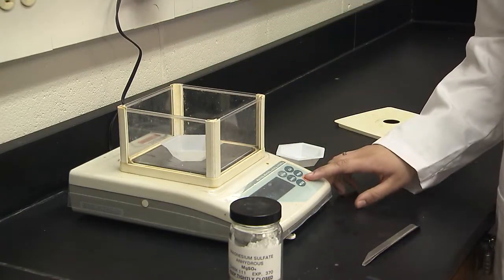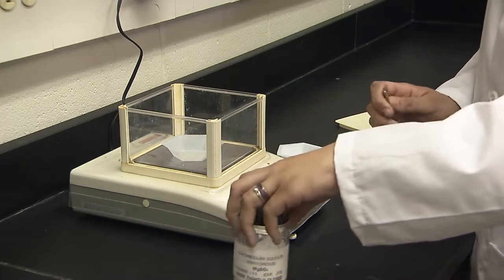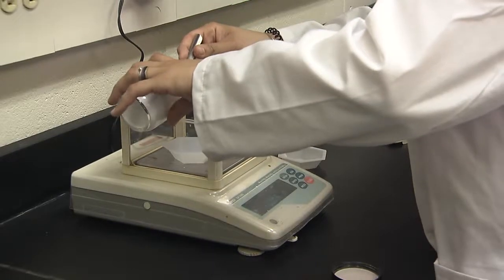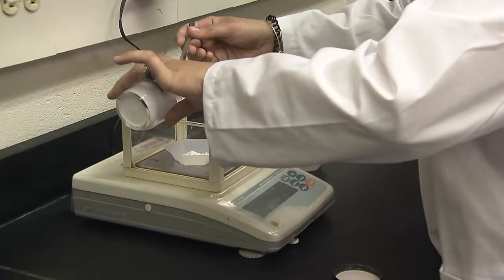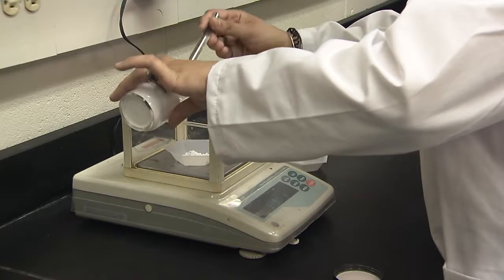Place 3.5 to 4 grams of anhydrous magnesium sulfate into the weigh boat. The exact amount of solid doesn't matter as long as it is in that range and you record all decimal places on the datasheet. As always, never return sample to the reagent bottle and clean the balance of any sample spills. See the How to Use Digital Balance video for more information.